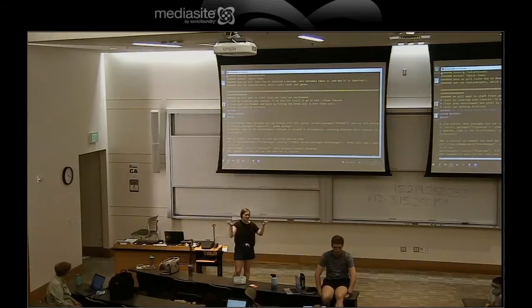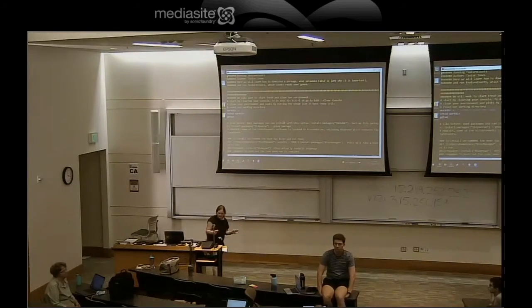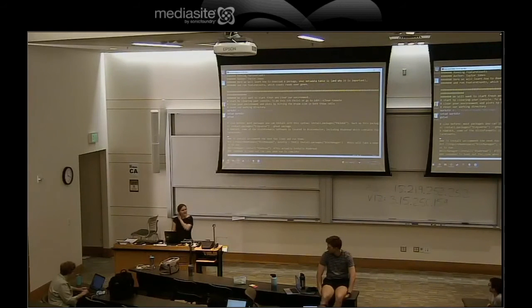Since we can't module load it, we can't run it at this moment, which is okay because I'll still show you what this script is and what you would do to run it. You're really familiar with this already, right? At the top, I'm setting a working directory for running your counts. On the small data set you mapped, chromosome 21, counts will go quickly. Typically on a full data set, with 8 CPUs or threads, which is in one of the scripts I'll show you, you can run multiple threads to do your counts. It would take about an hour, sometimes longer if your data set is bigger.